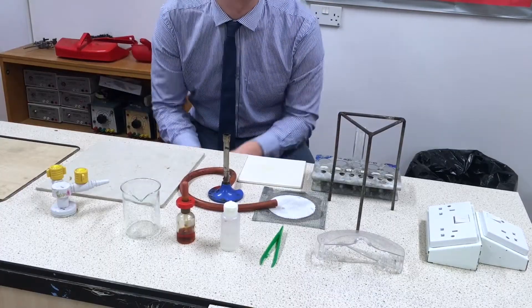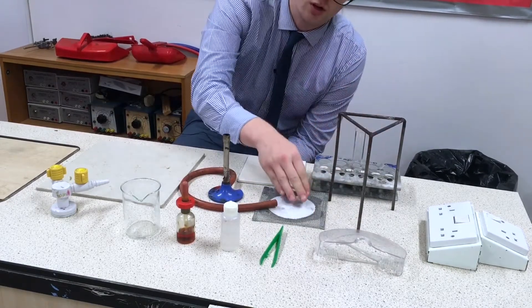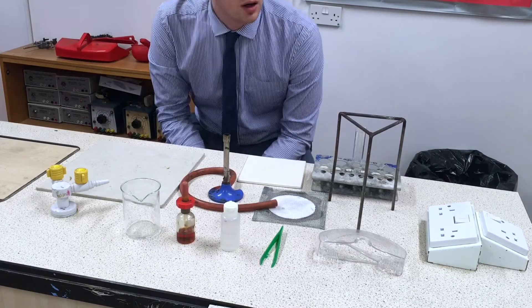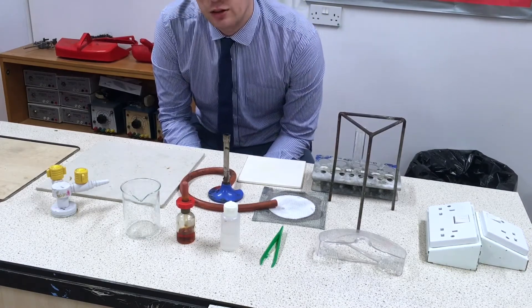Here's all the equipment that we're going to need for this experiment: our goggles, our tripod, gauze, Bunsen burner and heatproof mat. That's our standard heating things up apparatus. If you're not sure how to set up the Bunsen burner, check out my video on how to do that.